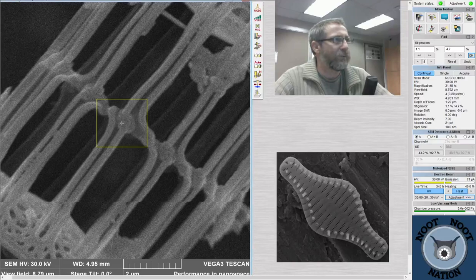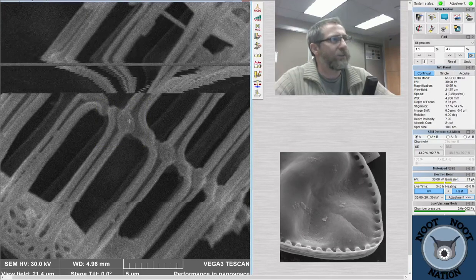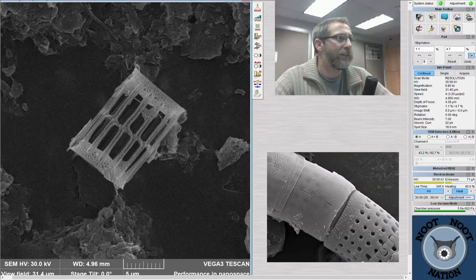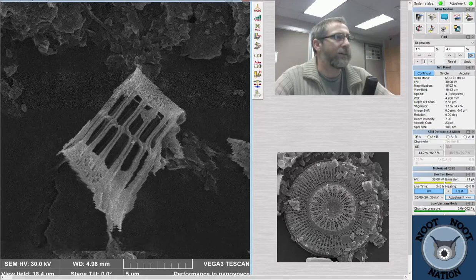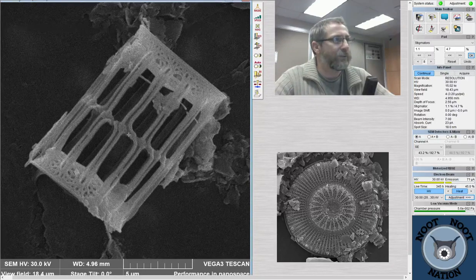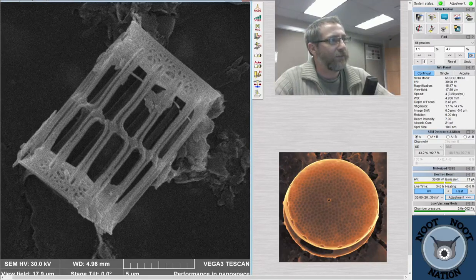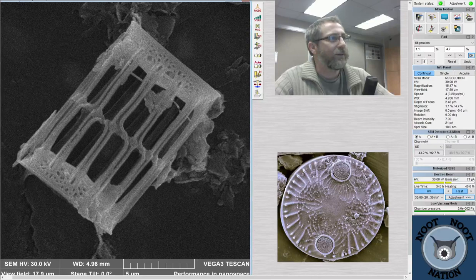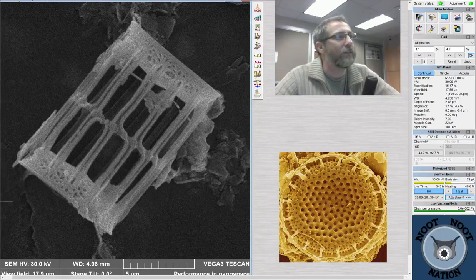Okay, so let's get that in focus and then zoom out so we can see the whole thing. So Skeletonema form long chains, and they link with these spines, as I mentioned, a very intricate structure to the spines, and as a result, they hold on to their siblings more tightly than they hold on to themselves. And when they die, their valves, this is half of a frustule right here, with the spine sticking up off it, and here's another half. So they actually rip themselves apart in this setting, trying to hold on to their neighbor. So they're more interested in hanging on than losing grip on their sibling.